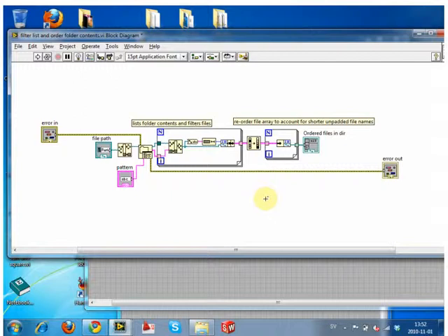Just like in the starter video I showed you with just 4 files, if I say order them, it gives them a wacky order. We need the order from lowest number to highest number, which, in how they're programmed, also means we need to order them into sections. We need to separate them out by how many digits the file name has. So let's look at file names of length 1, order all of those, and those go first. Then all the ones which have 2 digits, order those, and so on.